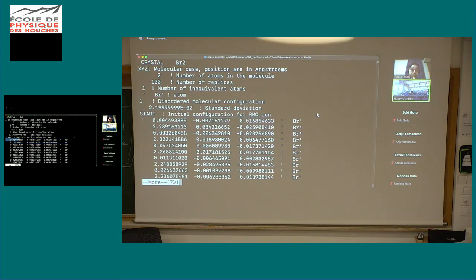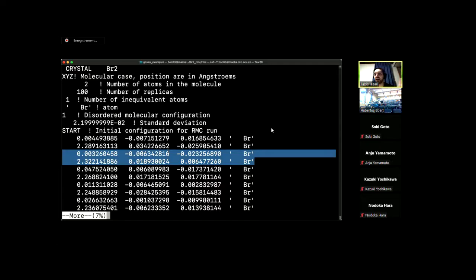One problem is that if you visualize all these molecules, it will be very overlapped, because if you see the coordinates here, this is one molecule, then this is the next molecule, and these two coordinates are quite similar, but in the program they are coded to be in different spaces, even if the coordinates are the same.